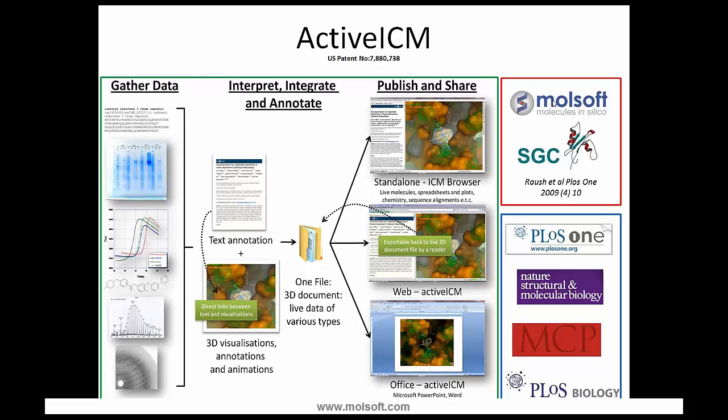This was developed in conjunction with the Structural Genomics Consortium in the University of Oxford, Brian Marsden's group there, and Ruben Abagyan here at MolSoft and UCSD. It was developed primarily because the SGC was solving lots of structures and they wanted to quickly find a way of presenting these structures to the general public without publishing them. But after a while, certain journals got interested, and there are quite a few papers in PLOS ONE and some in these other journals where the scientists have used a fully interactive 3D session to publish their work.